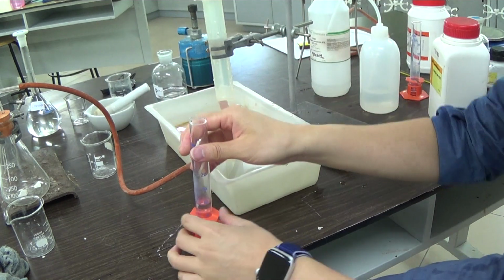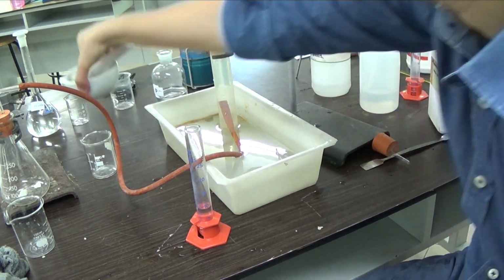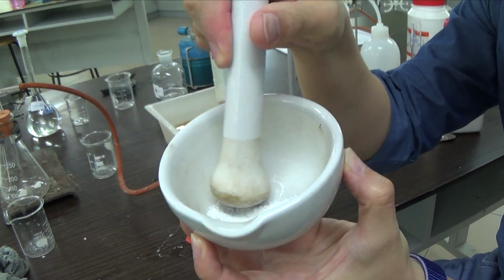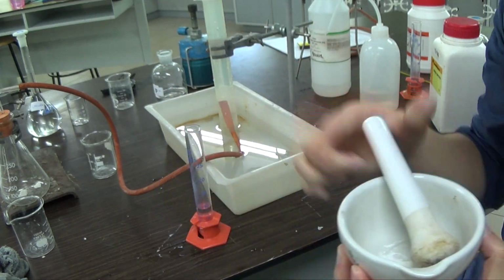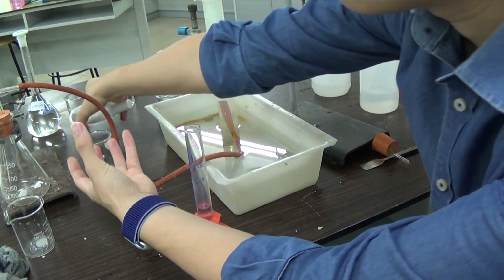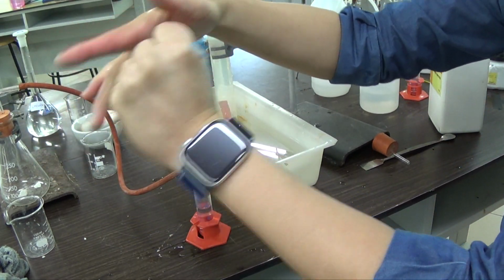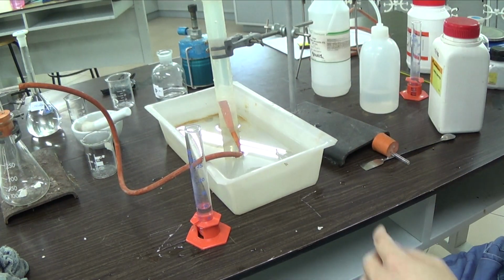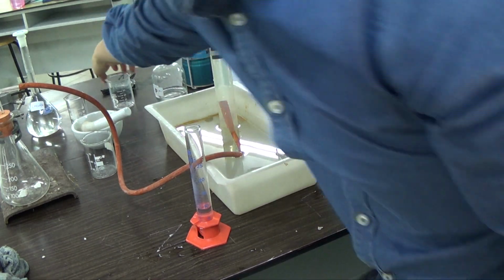Remember, I have to carry out 2 experiments. My objective here is to investigate which reaction is faster, using the crushed powdered marble chippings, which is calcium carbonate, or the lumpy form, which are just big pieces with a smaller surface area. When you have a big piece, only the outside is exposed to the acid, and therefore we will see how fast it is. So we can see how much volume of gas gets produced after some time.